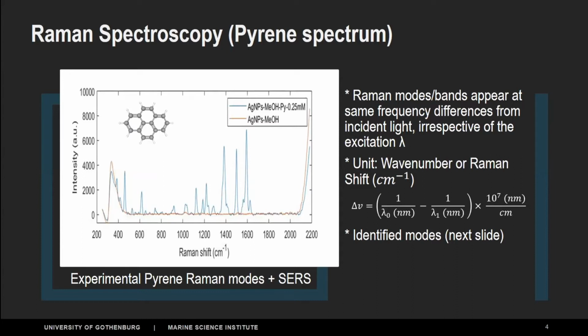So the beauty of this technique is that we can have different lasers. So even if you can't identify a molecule with one specific laser, if you can integrate multiple lasers in an instrument, then you can switch between lasers. But then it comes with a bit of a problem because the spectrometer is built to register in a specific wavelength. And then if you change the laser, you kind of have to change the grating in the spectrometer as well. But there are different solutions for that. You can rotate the grating so you can register the numbers that you are interested in.